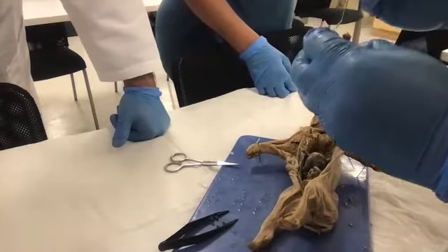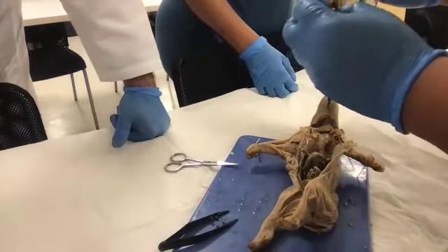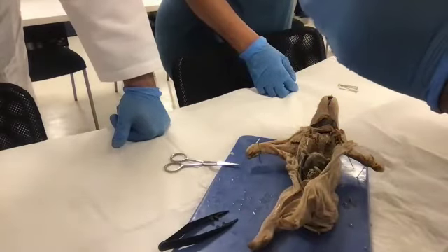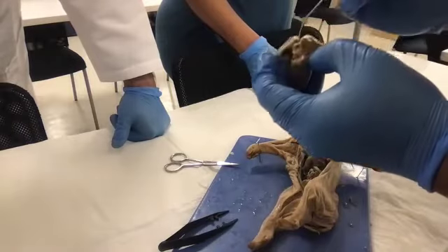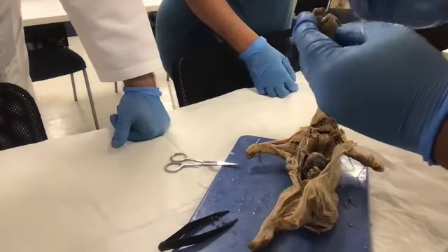And right off the top, even though it's small, look at this. See this one here? It's big. It's thick. It made a circle. Oh, no, it's not thick. It's kind of thin. So that's got to be what? A vein. Let's see if I can find the aorta.